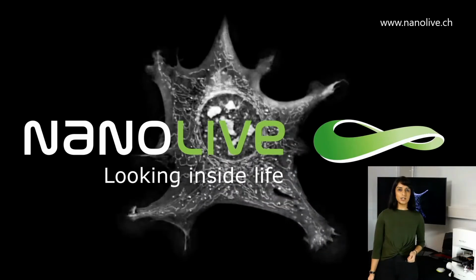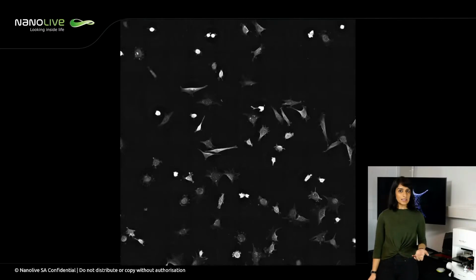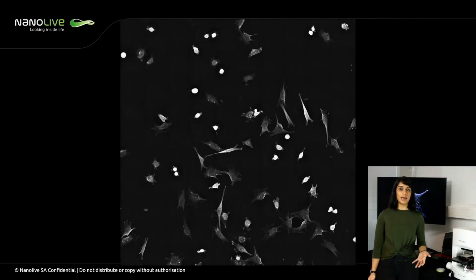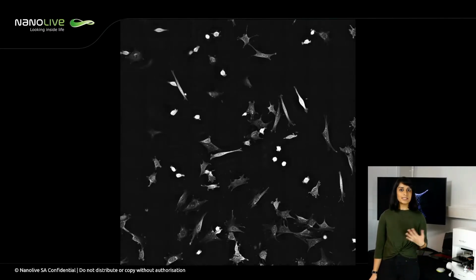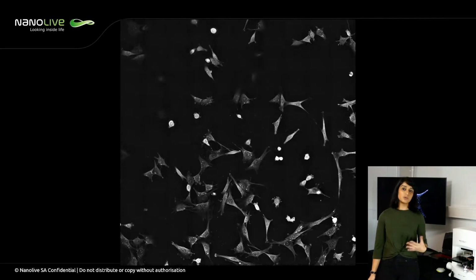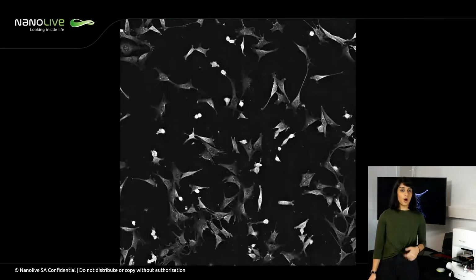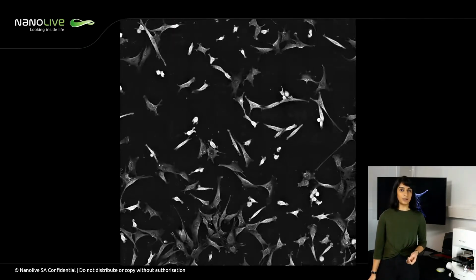Welcome to this presentation on Nanolive live cell imaging. What you see here is an example of a dataset you can acquire with Nanolive imaging. You can see cells in the environment roaming around, you can see the adherence between cells on the dish, and you can see the internal structures. All of this is completely label-free.